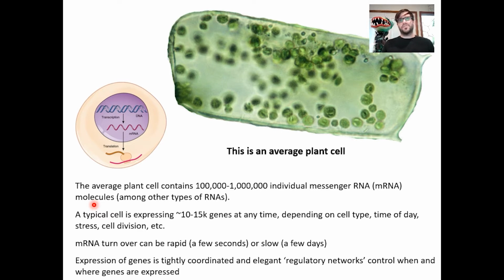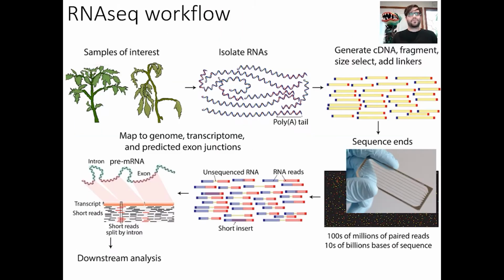And so we can survey really easily what genes are being expressed, when and how, and then we can use that to answer fundamental biological questions. And so this general approach of assaying what genes are being expressed and how, we would call this gene expression analysis, or what is most commonly used now is what we refer to as RNA-seq, and so that stands for RNA sequencing.